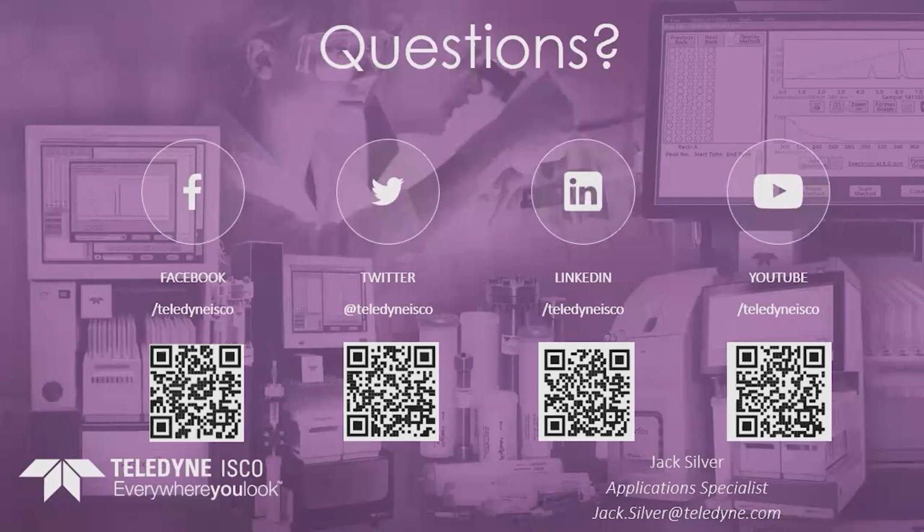Okay, we'll leave it open for a little while longer and then we will close.